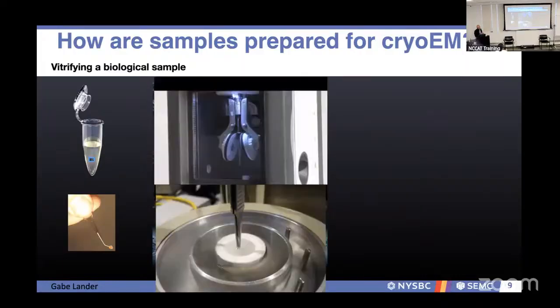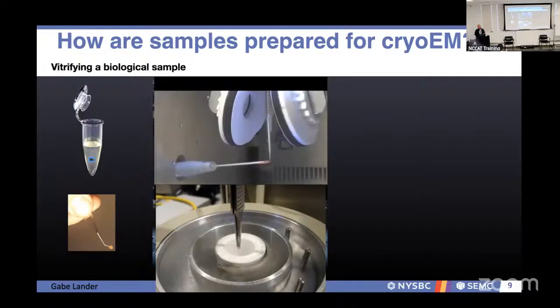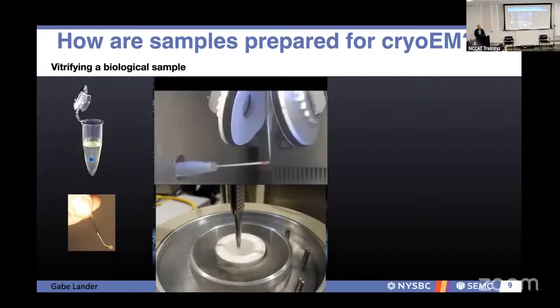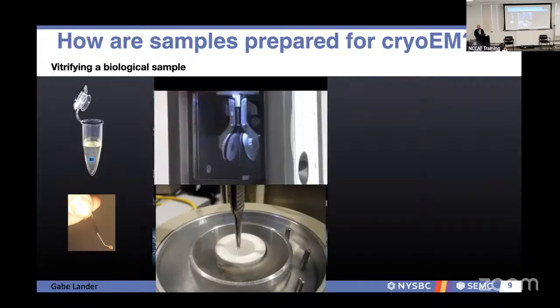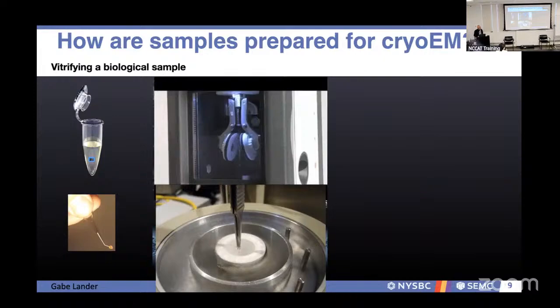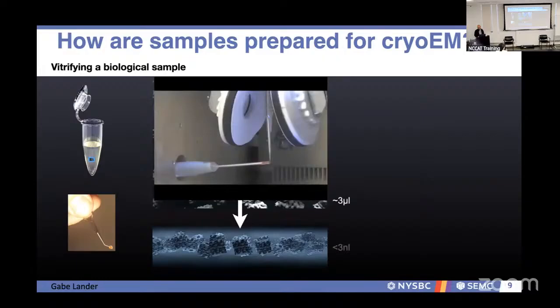One way of doing this that you may have seen would be to apply a sample to our slide, as it were, our glass slide in terms of light microscopy. For EM, it would be this 3 millimeter metal mesh. Once you treat that, you can add your sample and use common filter paper you find in the lab to thin out the sample.